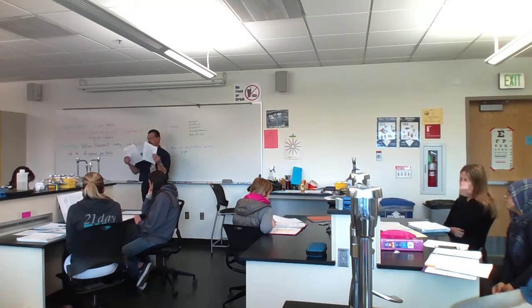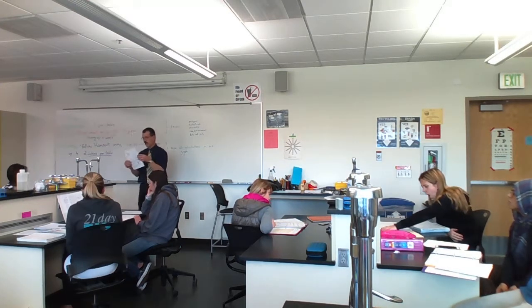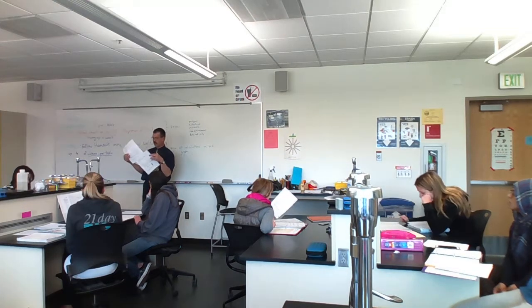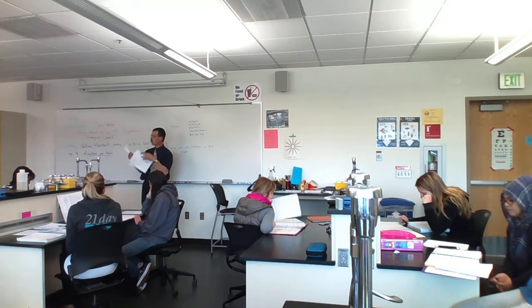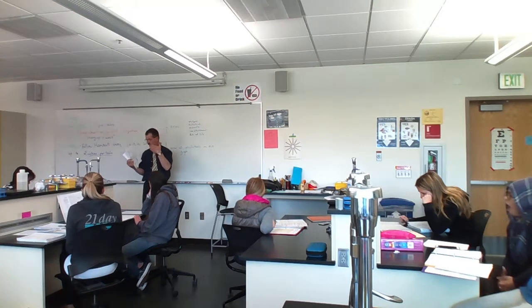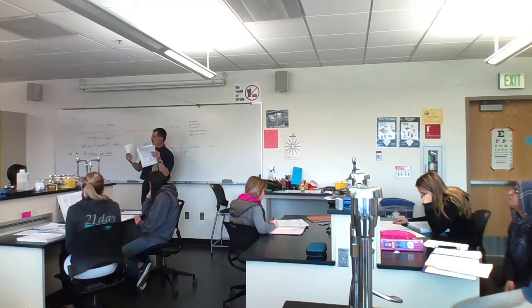So what I would recommend you do before you just dive in and breathe is please read through step by step how it wants you to breathe. Because if you breathe incorrectly, you'll get all the wrong numbers, and I'm going to send you to a pulmonologist or something, right? So read through it first, make sure you understand that it wants you to breathe so many times and so many times, and then do it, and then calculate the numbers.